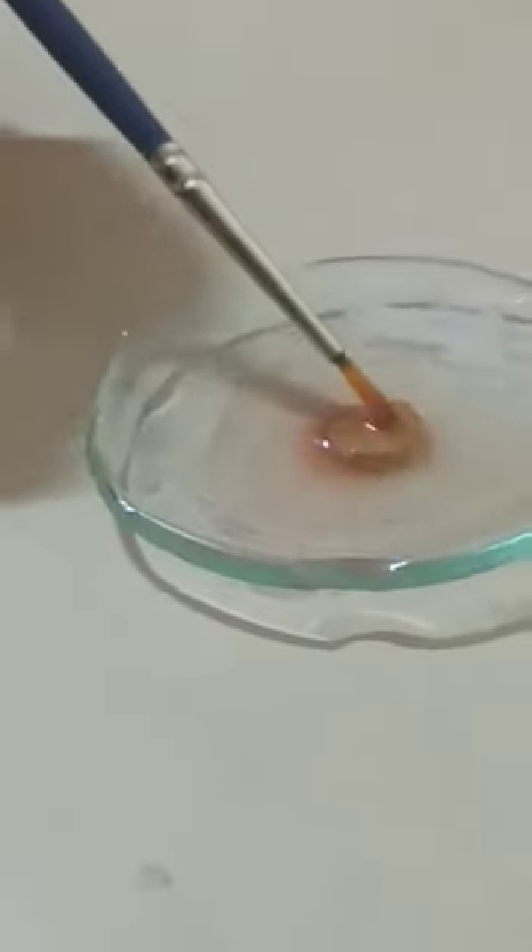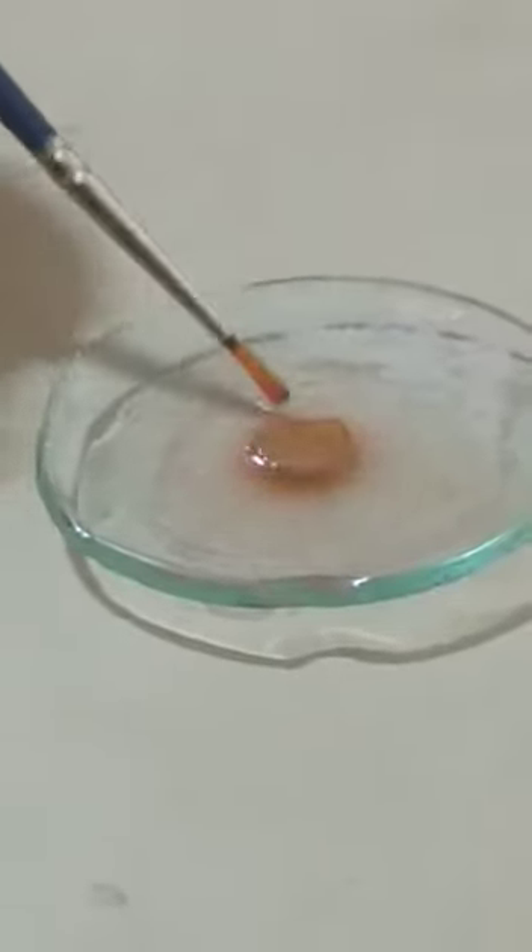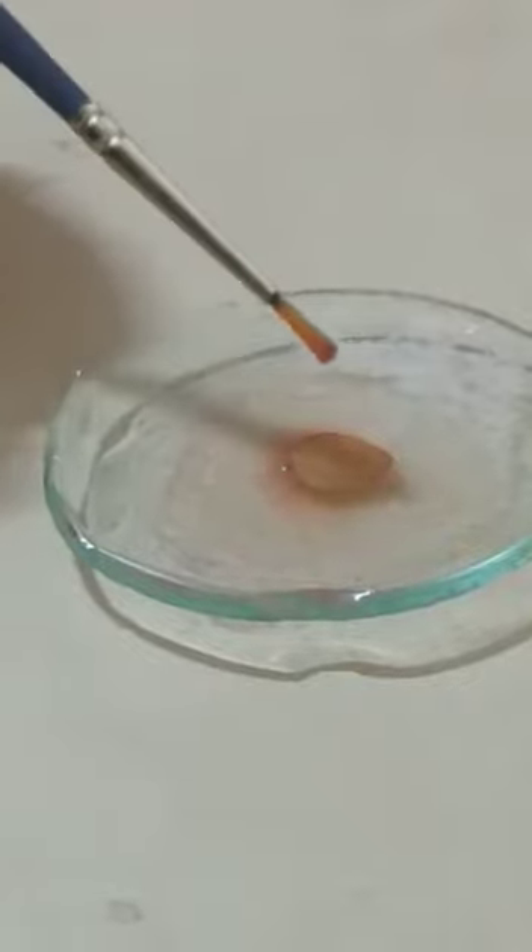Transfer this transverse section (TS) to the staining solution. This is a mixture of fluoroglucinol and concentrated HCl in a proportion of 1:1. Keep it for five minutes.